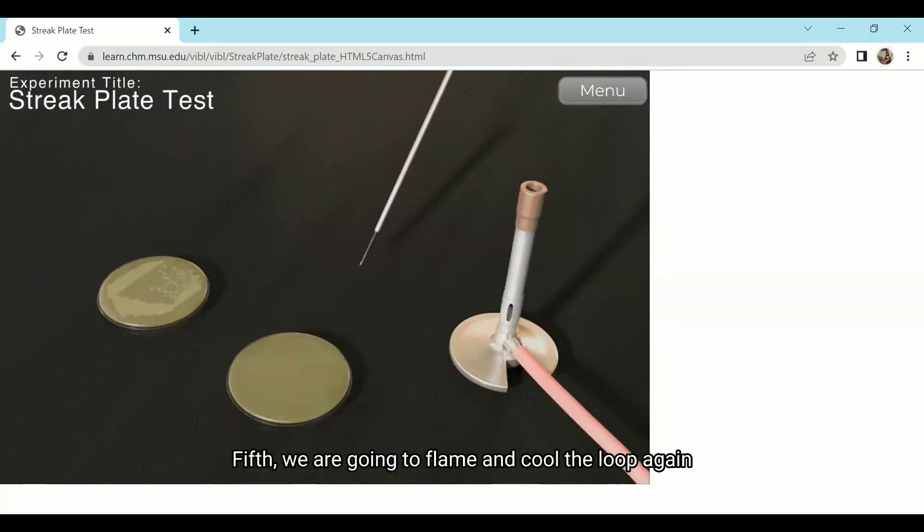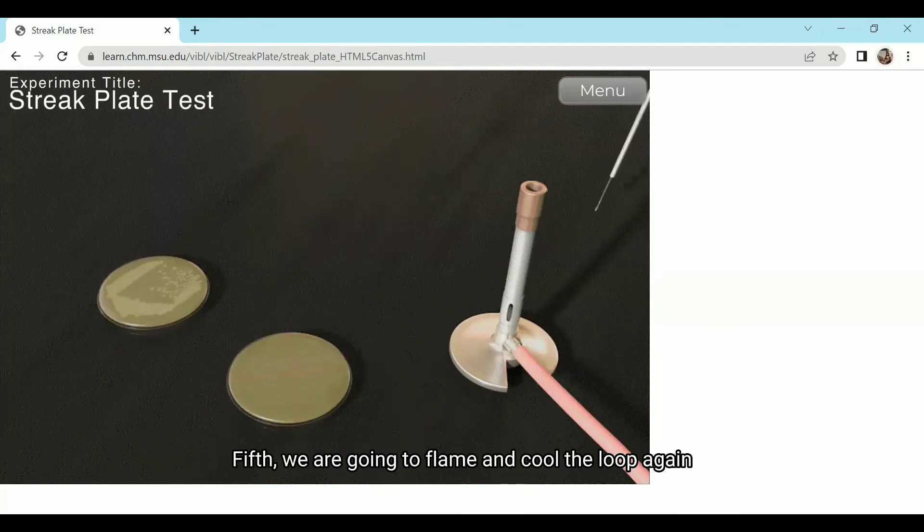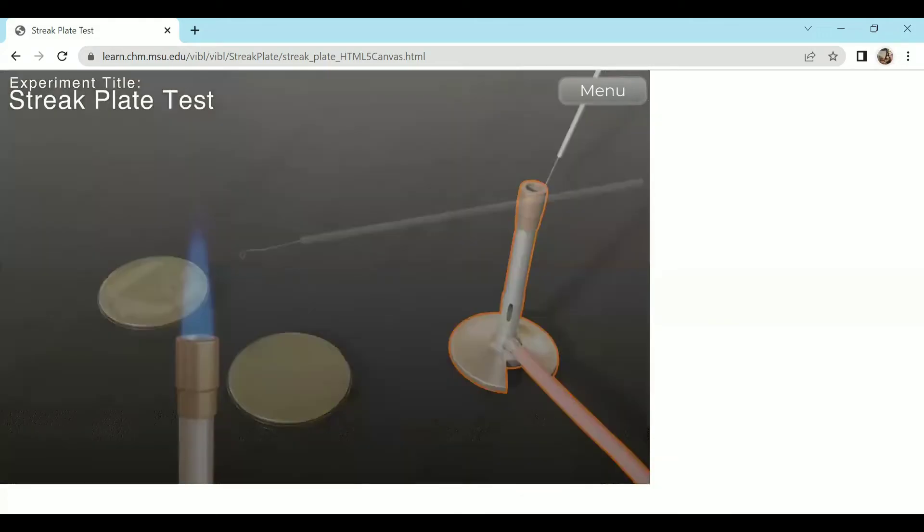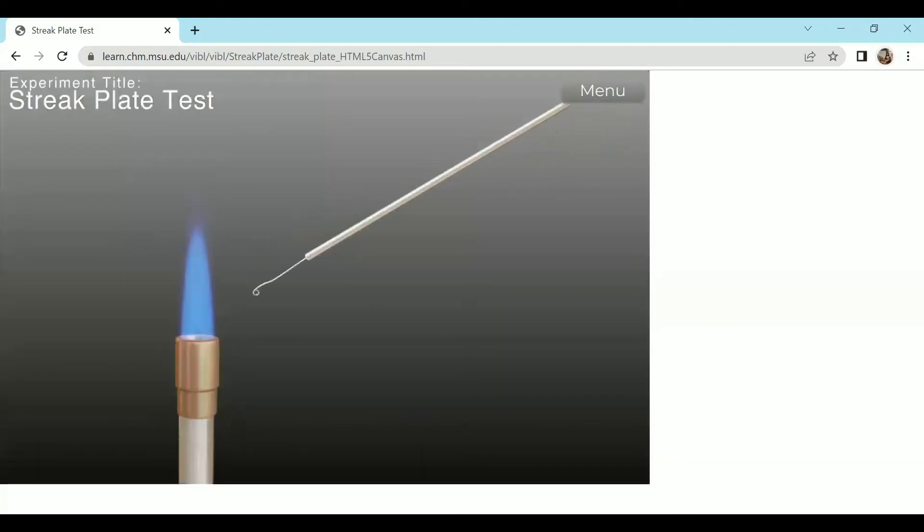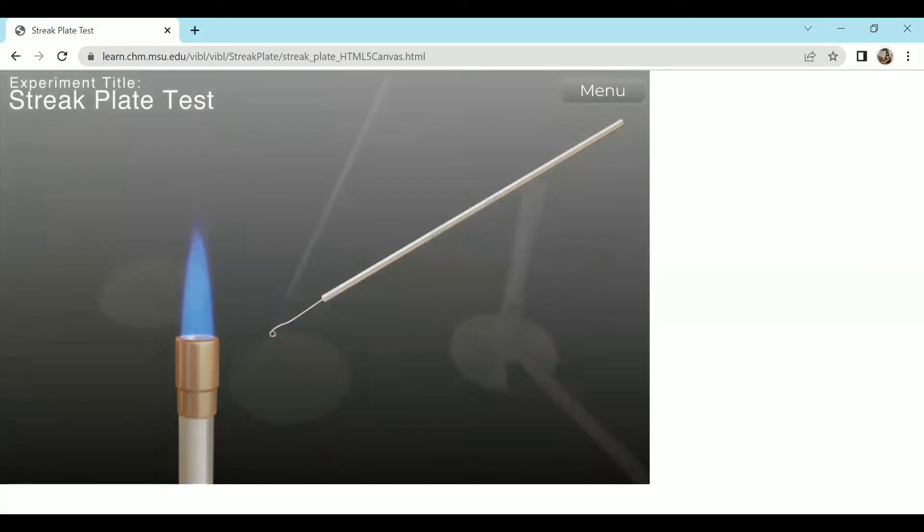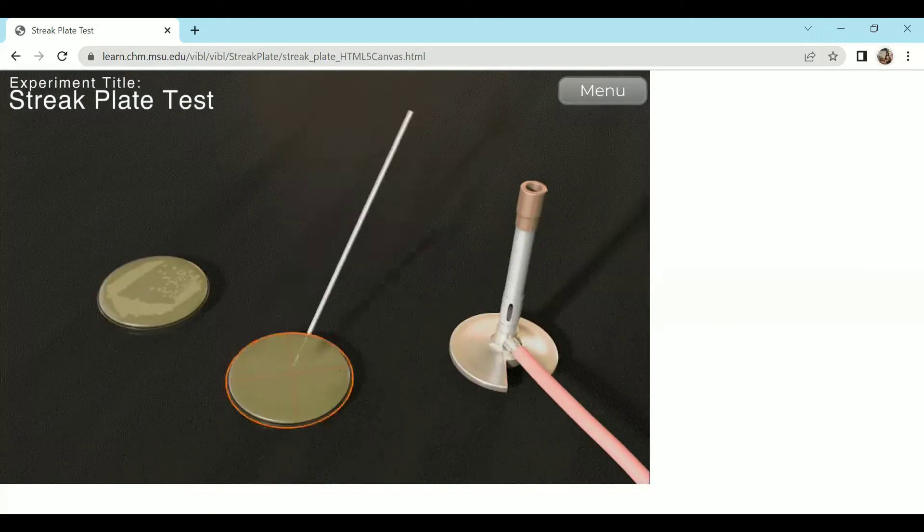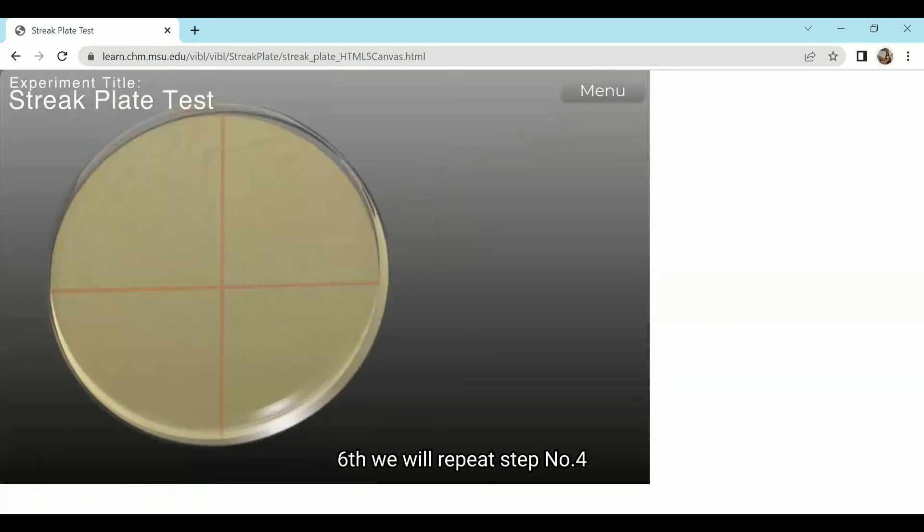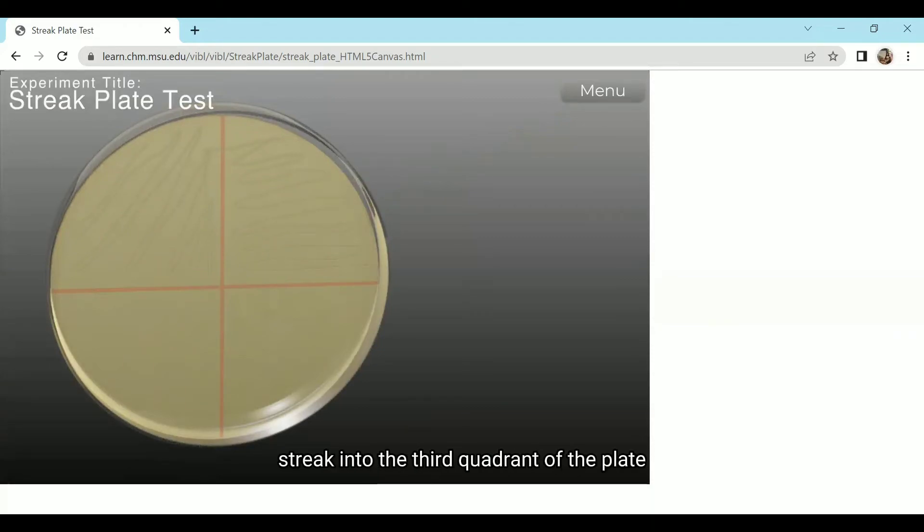Fifth step, we are going to flame and cool the loop again. Sixth, we will repeat step number four but now we are going to streak into the third quadrant of the plate.